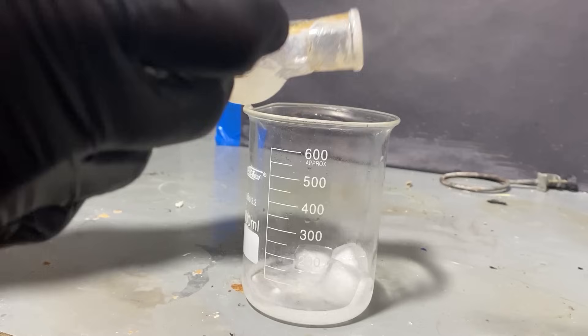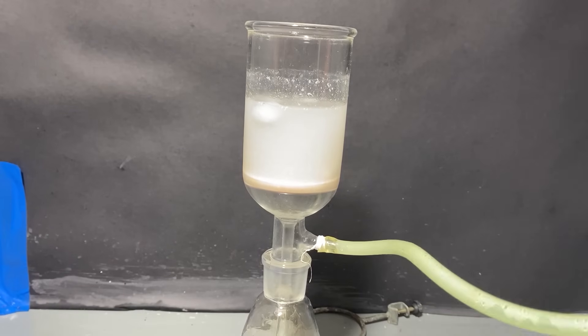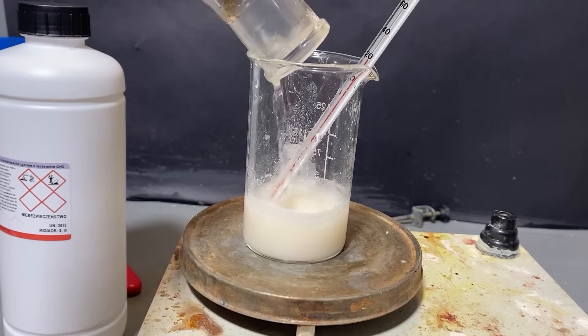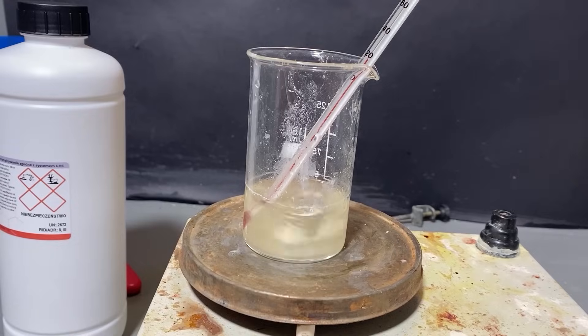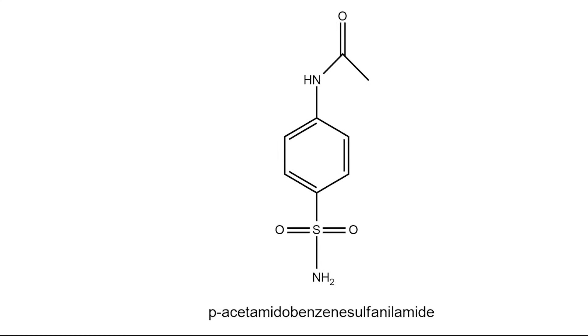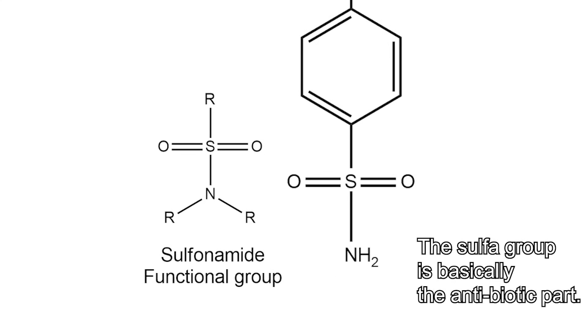Let's precipitate our product by dumping it into ice-cold water. Next, I've done a vacuum filtration, and here's some of our product. I collected everything in the beaker, and then added some concentrated ammonia solution. Besides the fact that ammonia smells like piss, it's a very useful reagent. Here, we are using ammonia to replace the chlorine atom with an amide group. With the chlorine replaced, we've essentially just formed the sulfonamide functional group, which is what makes the magic happen.